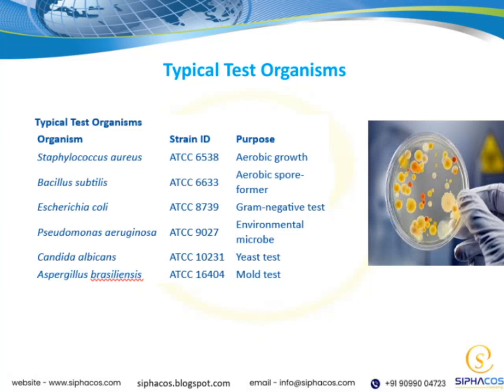Now, let's take a closer look at typical test organisms. These are the microorganisms we commonly use when conducting laboratory tests to identify and study pathogens. They serve as standard references because they help us understand how different organisms behave and respond to various diagnostic methods. Highlighting these key players is essential because they form the foundation of microbiological testing.